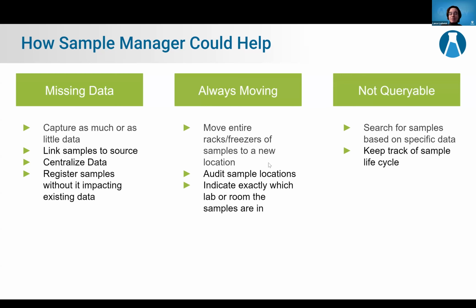And finally, searching in Sample Manager would have been super easy. I'd be able to pull a list of all my samples disposed of based off of the specific data that their source was linked to. And this would have made it so much easier to track the sample life cycle and know exactly which samples I had already disposed of as well. And this would have made us more readily able to report to the client exactly what samples they had remaining.